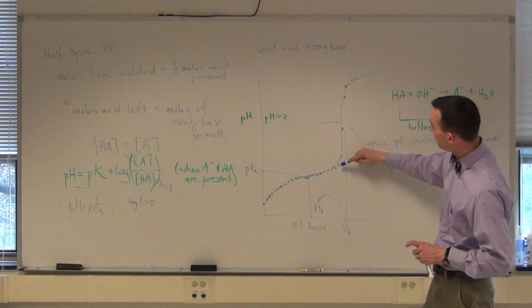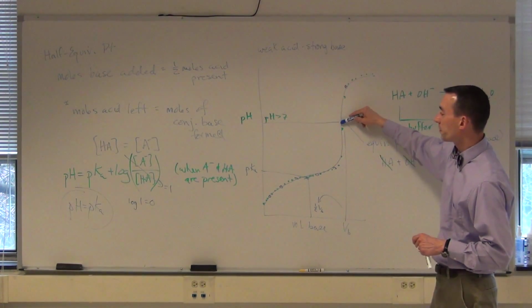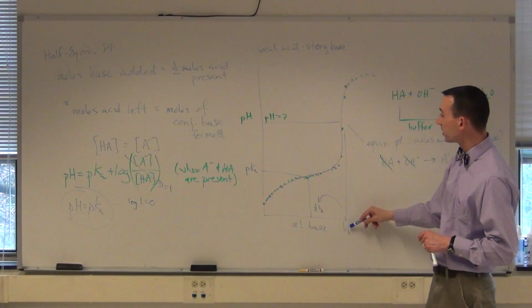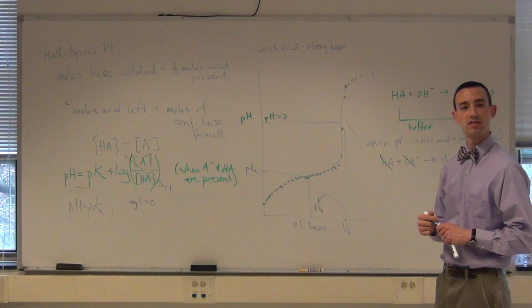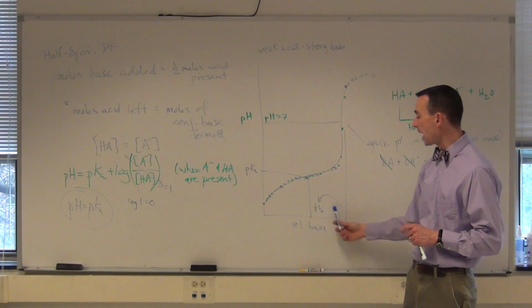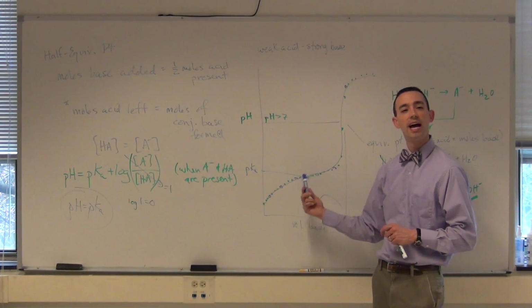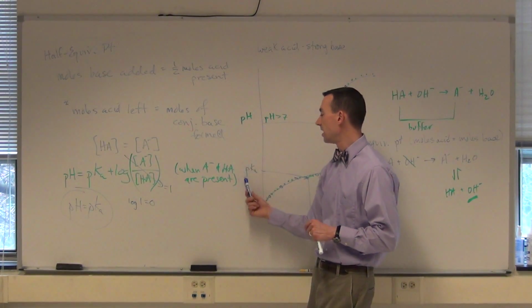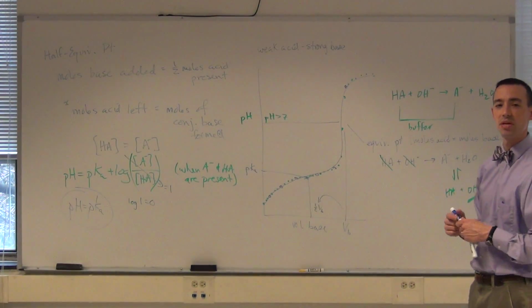You'll want to look for the biggest jump, and in the middle of that biggest jump, that's what you will call your equivalence point, and that volume is what would kickstart your calculations for determining the molar mass of your unknown, and then going to half of that volume and simply recording the pH at that half volume, which gives you the pKa, and you can calculate the Ka by taking 10 to the negative pKa.